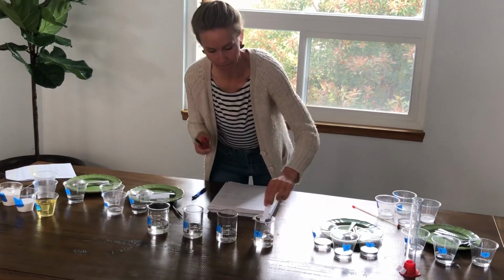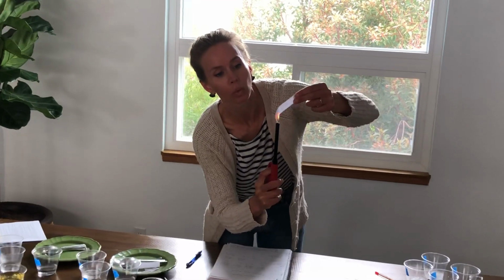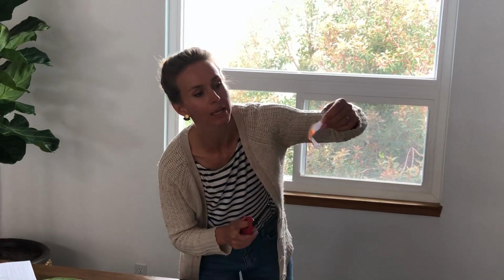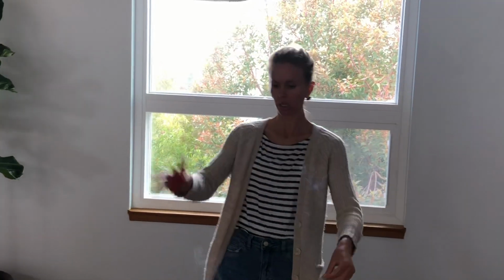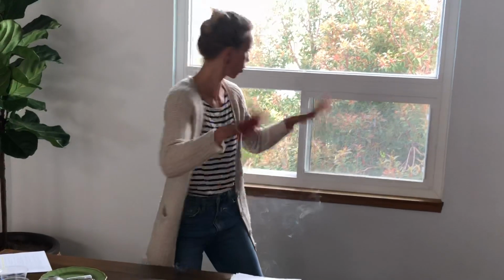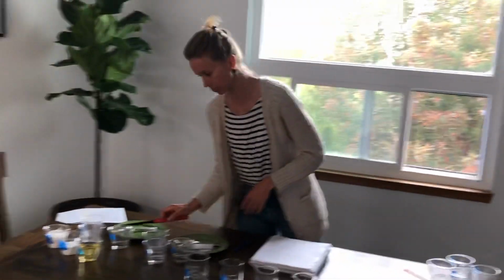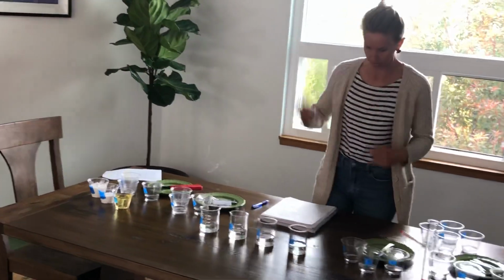Yes, liquid number 3, definitely flammable. Okay, and liquid number 4. Okay, nothing like number 3, but let's say yes, slightly flammable. All right, fun in the chemistry lab. I'm so sorry that we had to miss this lab altogether.